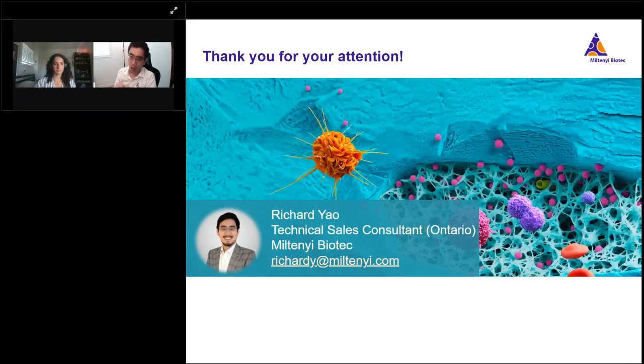And price-wise, they are actually quite similar in terms of the regular standard vial size. So my 2 cents is that if it's possible, always try to start with ultra pure beads. And even if not, try to do a side-by-side comparison and see which one would be potentially your preference. Okay, all right, that's a good answer.